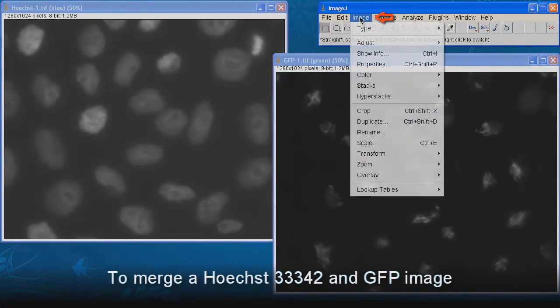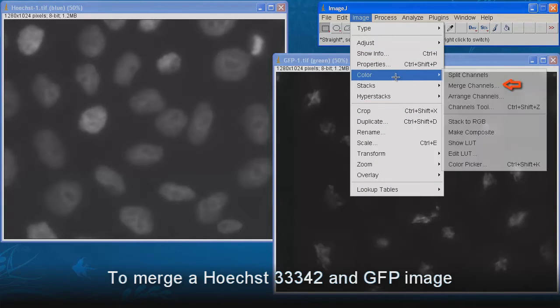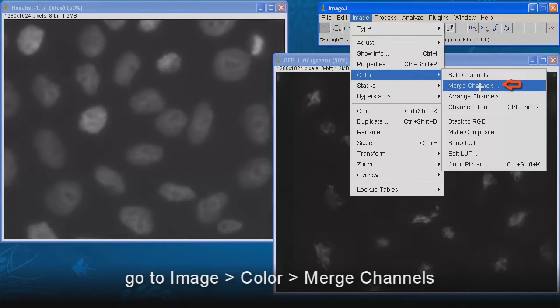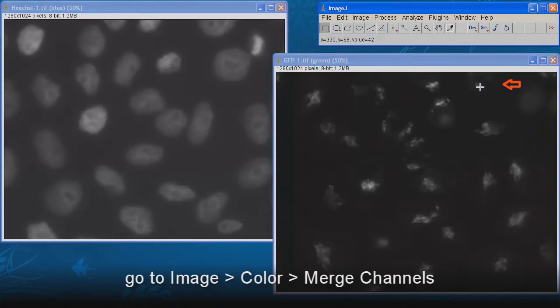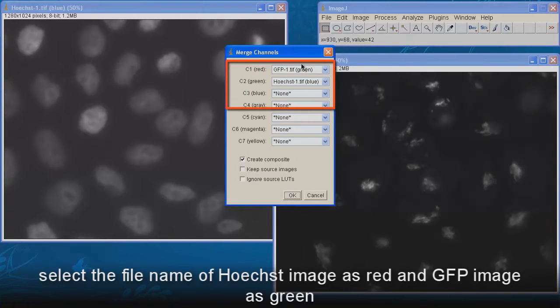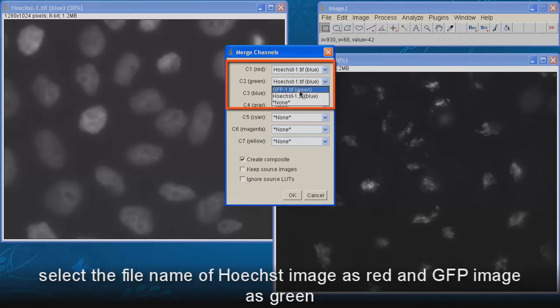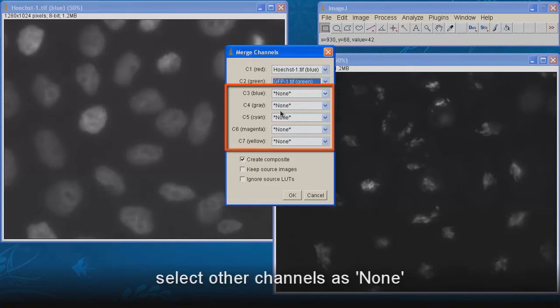To merge a Hoechst dye and GFP image, go to Image, Color, Merge Channels. A dialog window pops up. Select the file name of Hoechst image as red, and GFP image as green.